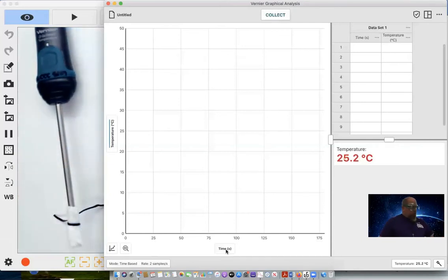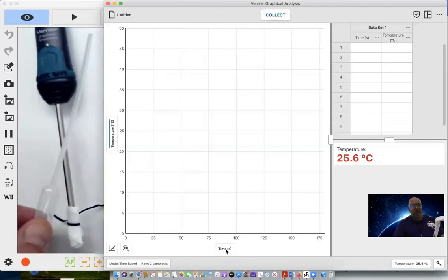So I'm going to get nail polish remover that I have available, acetone. And I'm going to get just a small amount into a thin stem pipette. These thin stem pipettes will hold a little over 3 milliliters. There's actually a line on here which would give you about 1 milliliter.